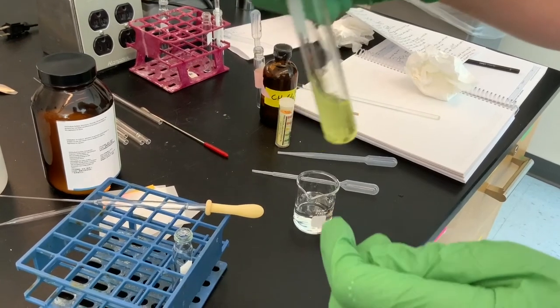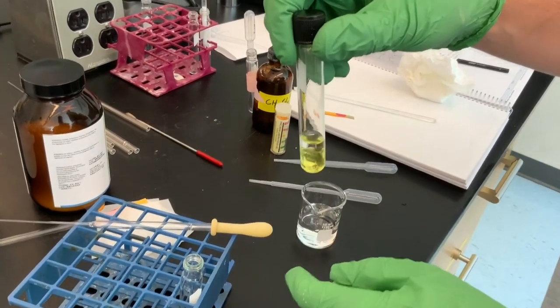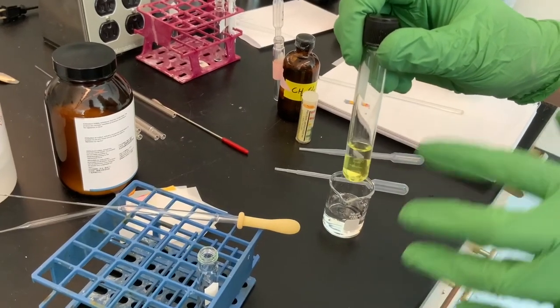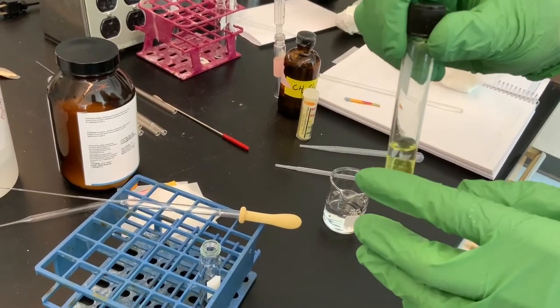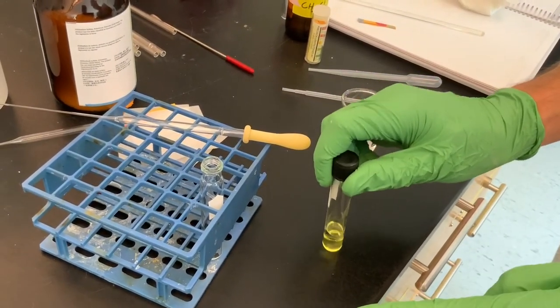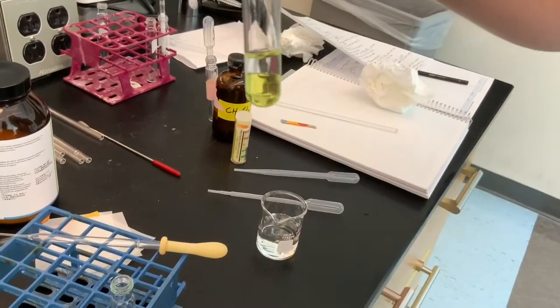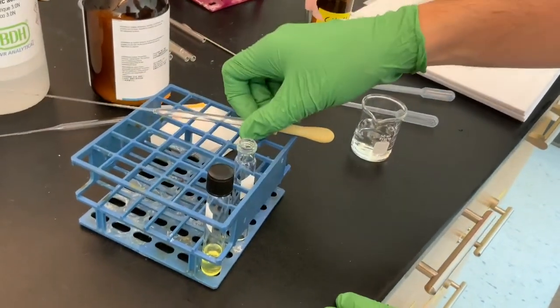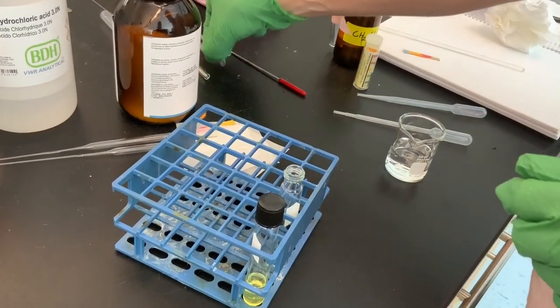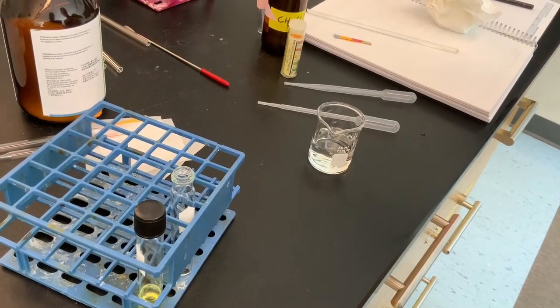And then we're going to combine the two aqueous washes and add them to another culture tube. We don't care about those aqueous washes. There's nothing in there that we want, but we're just gonna save it in case we accidentally made a mistake. That's common practice. Leave everything present until you know that you've actually done a good job. All right, so I'm gonna use another Pasteur pipette, because this one was acidic. I want everything to be neutral water in there.